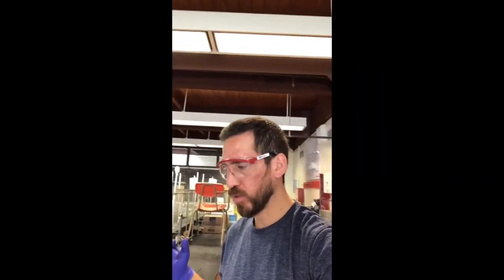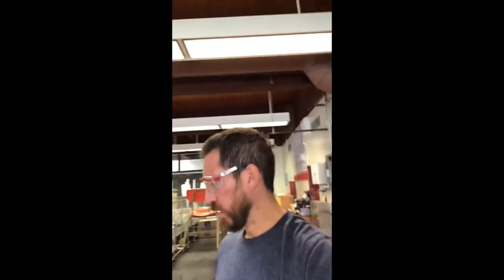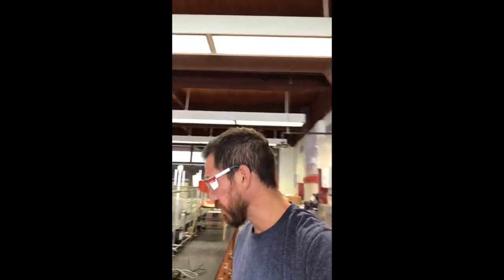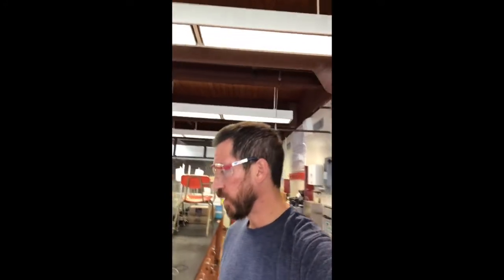So what we're going to do is throw these inside of a water bath, which I totally got set up right now. Let me show you as I move that camera real quick. I'm going to have to hold the camera so that you can actually observe closely. I'm sorry, forgot to shake your hand. Earthquake! Basically, the only ones that aren't going to go in the water bath are number 4, 6, and 7. So it's going to look a little complicated, but let's take a look.